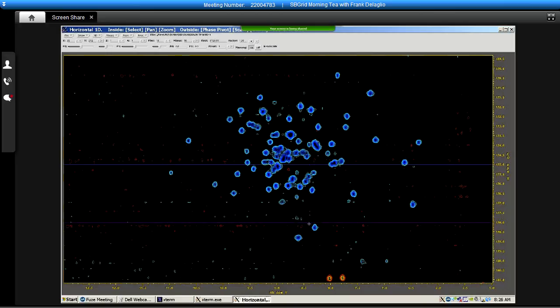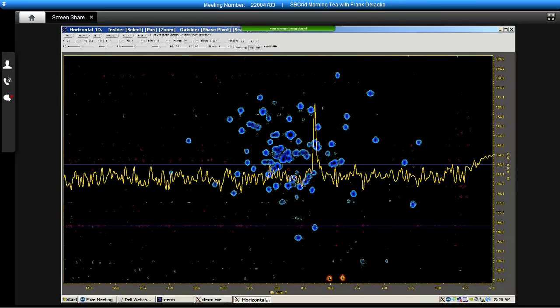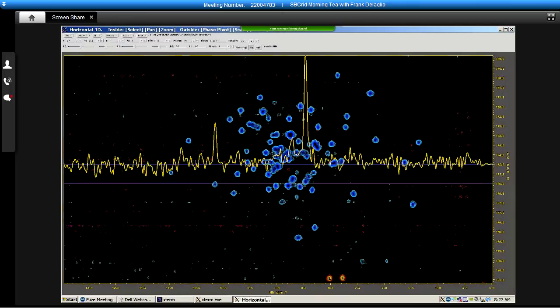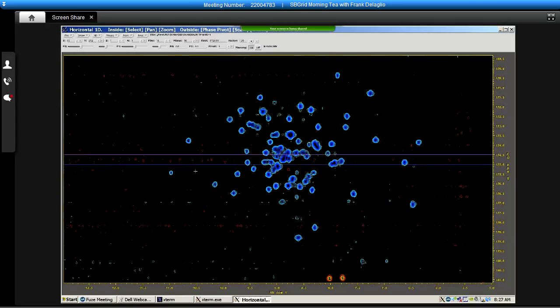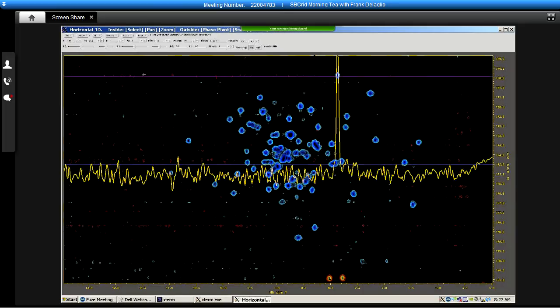what we'll see is that particular rows of the data have a baseline offset. So this blue line is where 0 is, and the spectral data in this particular row is substantially below that 0 line. So what that means is that there are systematic baseline distortions still left in this spectral data, left over as a result of the solvent signal that was in the original time domain.